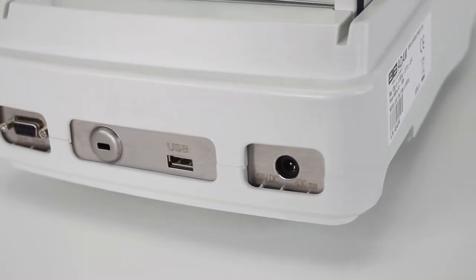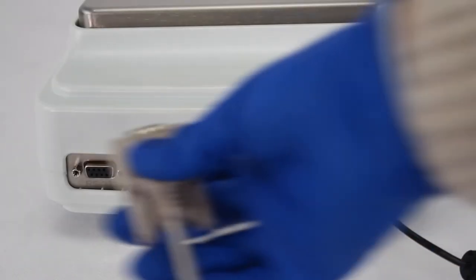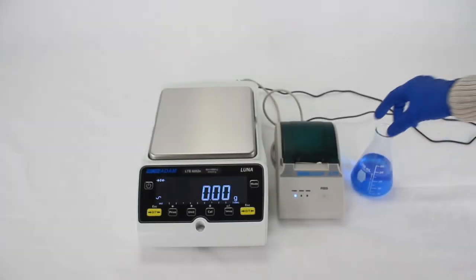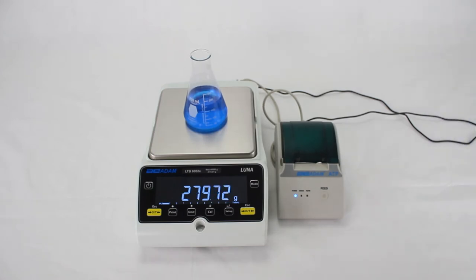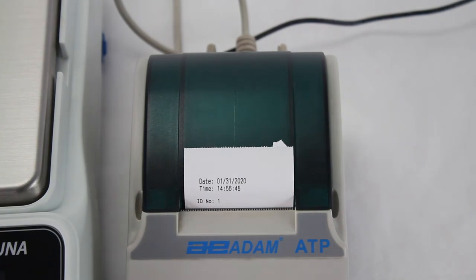Data sharing and connecting to devices like PCs or printers is simple. For effortless connectivity, LUNA comes equipped with standard USB and RS-232 interfaces. LUNA can output reports formatted to meet good laboratory practice guidelines, simplifying record keeping.